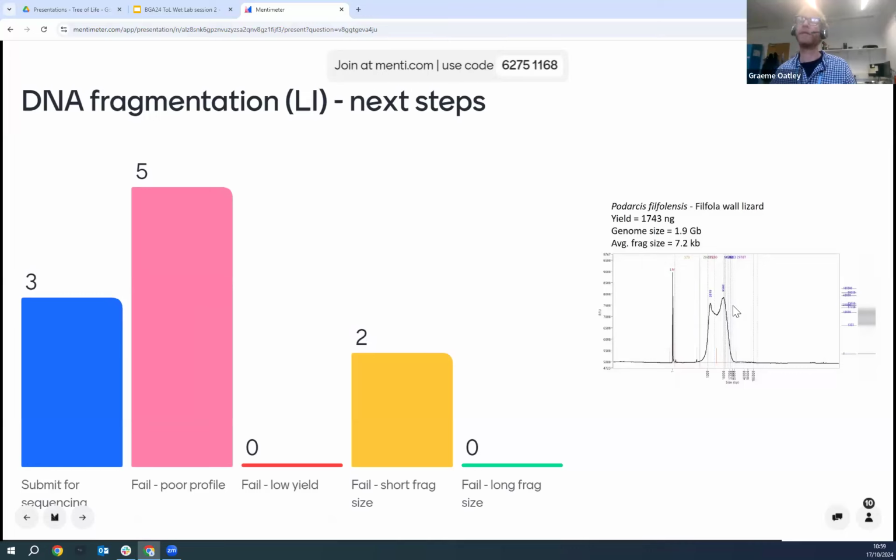So something I haven't mentioned is that post DNA fragmentation, there is something our scientific operations team does during the library prep phase, which is called a modified SPRI. It's another SPRI step that they will add to a sample if we request it, that will get rid of anything below the 8 to 9 kilobase mark.